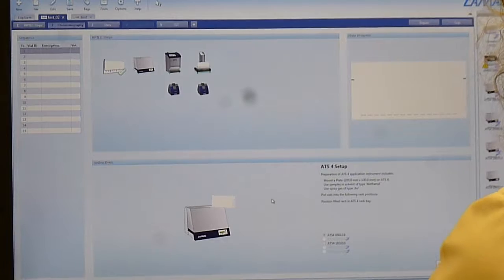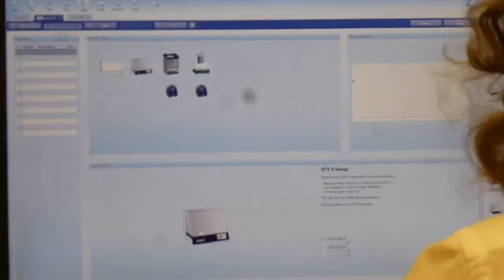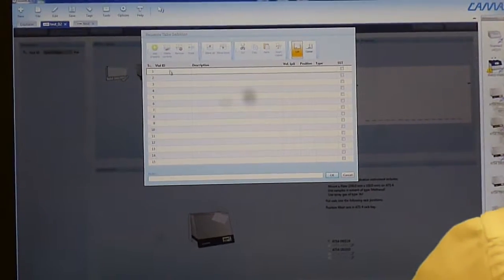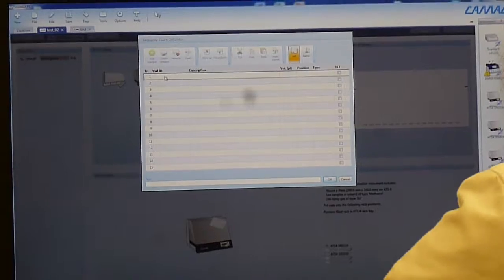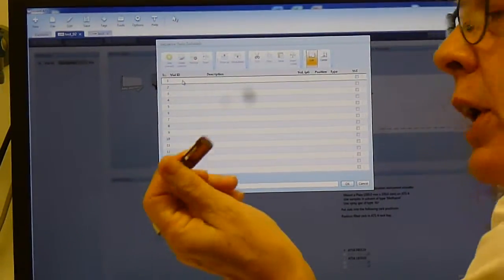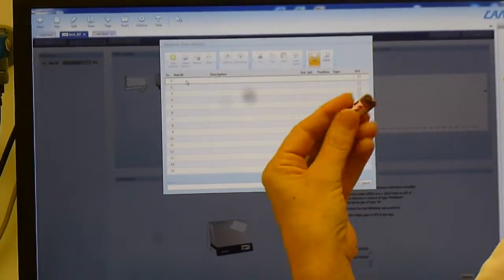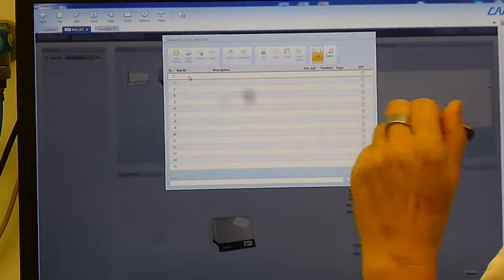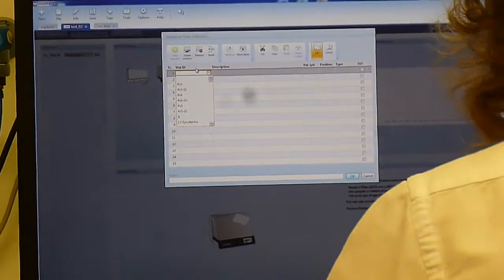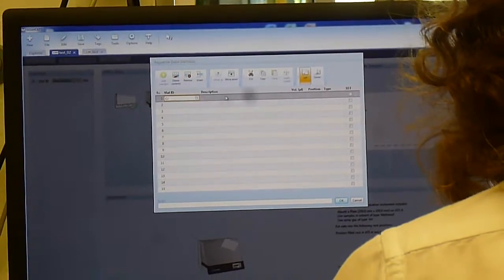Okay. And now the analysis is created, and here the first step is to fill my sequence table. And here I write the vial number. Every sample from us has a vial number, so we can look for the samples when we judge something. And in this case, I will start with the standard. This is CR. It's granular.